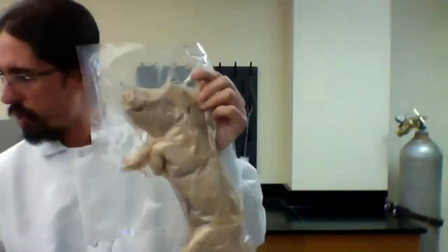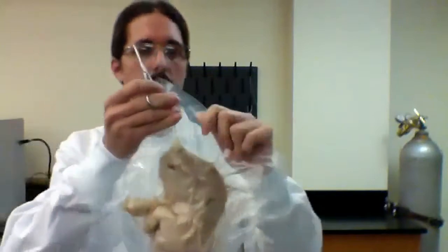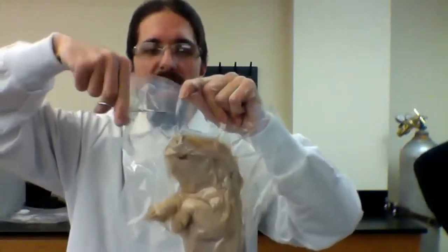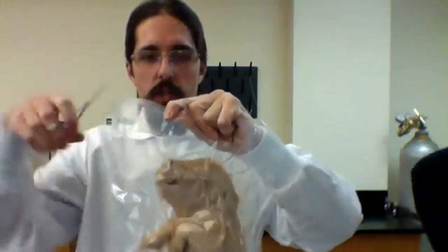All right, so to start with, you would just open the bag, and it's vacuum sealed. There is fluid in the bag, so have your students be very careful. And I forgot a step, 2 steps actually, which is very important because we want your students to be safe. Rubber gloves are needed. They will be provided for the students the day of the event. And then safety goggles, splash-proof safety goggles, which your students need to bring.